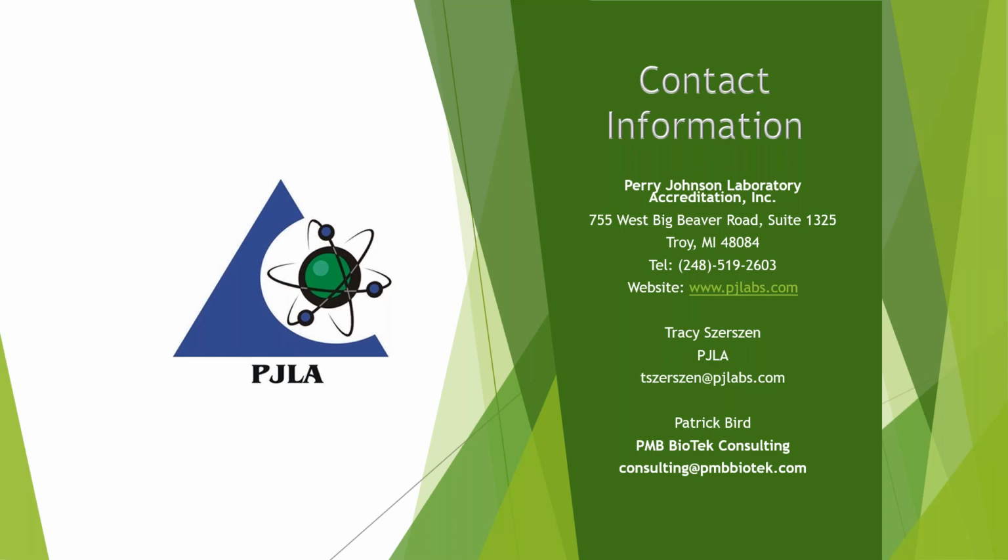When we talk about quantitation, right now I am not a strong proponent of quantifying using molecular methods. We need to see more data to see them to be accurate. And I say that because we have had some issues with methods going through validation where they're trying to quantify. So I recommend that if you love your molecular technology and you want to quantify using it, try exploring testing it at a threshold instead.